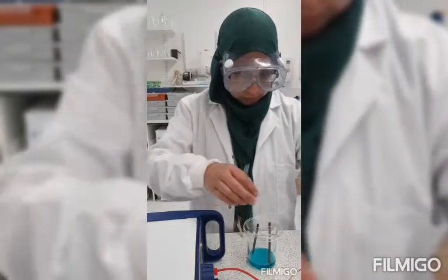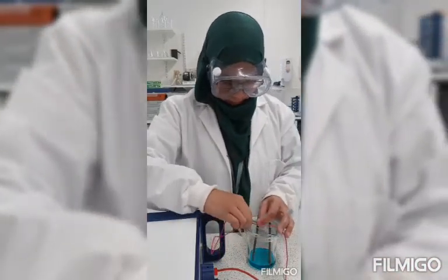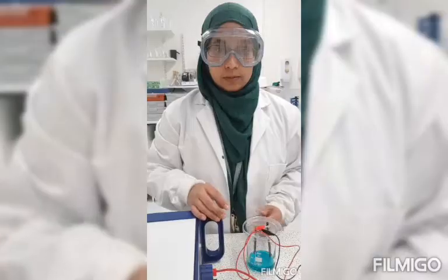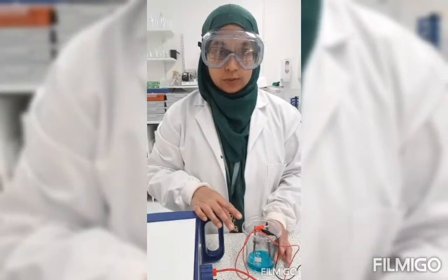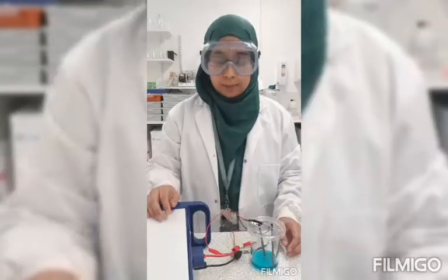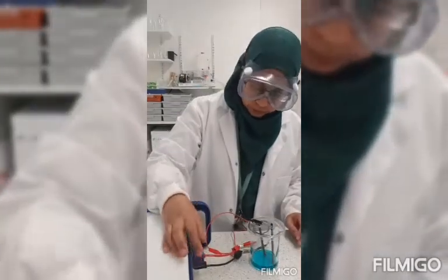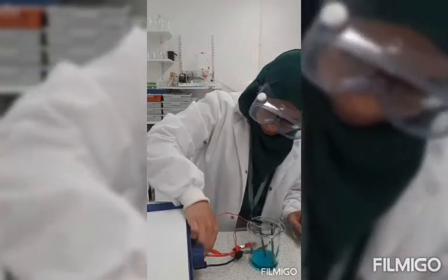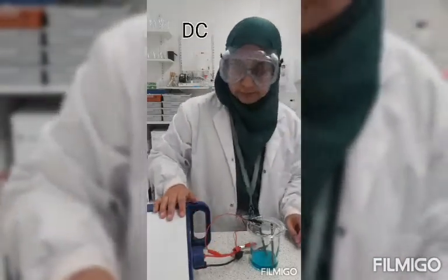Connect one to the positive and the other one to the negative, making sure they're not touching, otherwise there will be a short circuit. Now my power pack needs to be set to 4 volts and plugged onto DC.